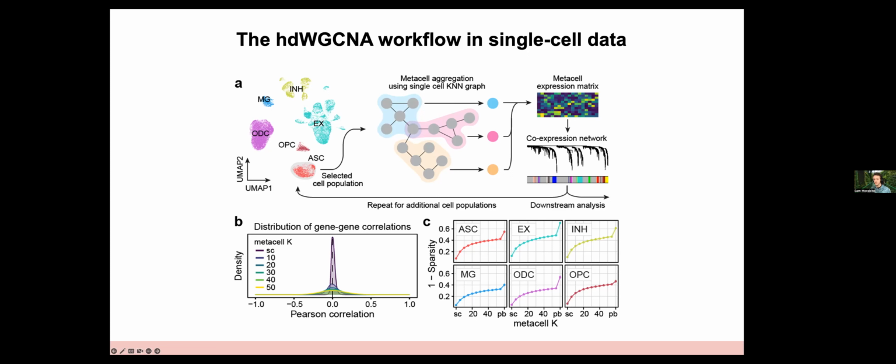The last question is from Angelique Golding, and she's saying, is there a specific reason that metacells were used over pseudo-bulking all the cells of a particular cell type of a sample? Yeah, so I think metacells versus pseudo-bulking is a good point. Essentially pseudo-bulking doesn't account for cellular heterogeneity in the same way that metacells does, because you're merging very disparate cell states.